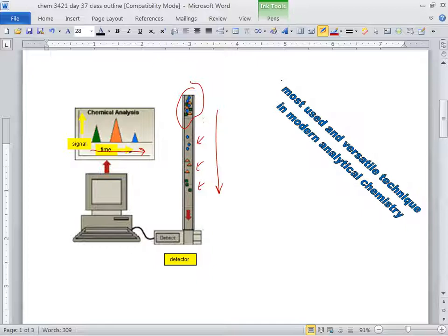Now, is this going to be a fast process or a slow process? Slow, so we're going to keep going here. Marlena's just going to sit here and stare at it the whole time. But that's okay. Now, some of these were permanent markers. What's going to happen? They're not going to move. That solid line should just stay there, right? Should. Okay.